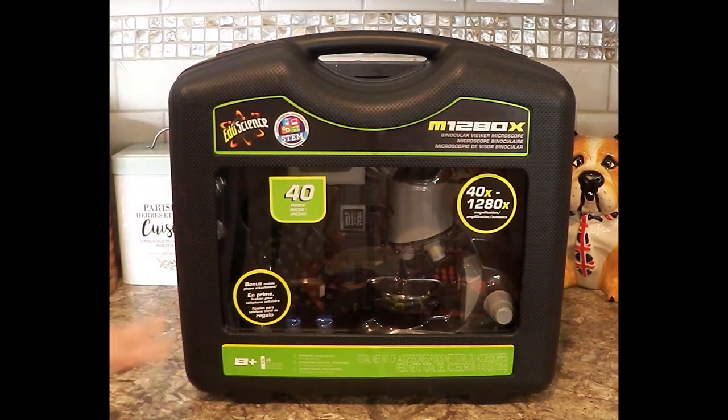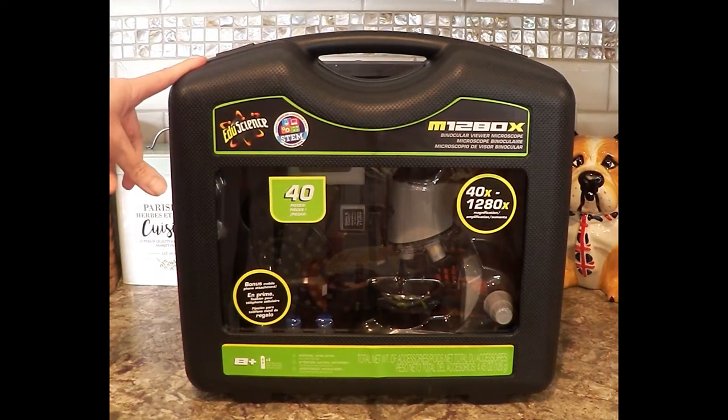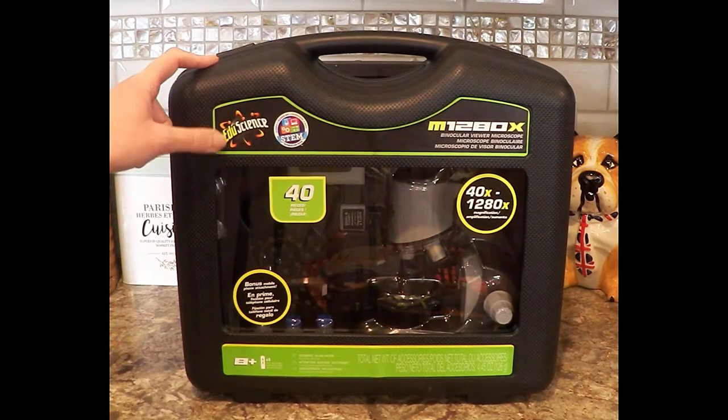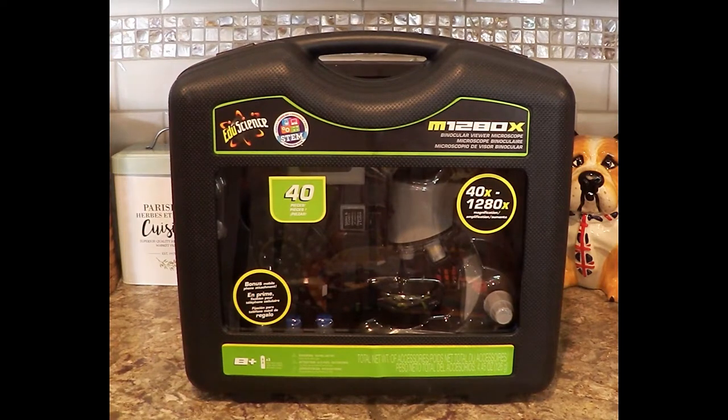So we've been looking at a microscope, and we have a bunch of slides that we got with something else for our little guy. I saw these EduScience kits. This was the top of the line that they had there. I believe the price at Toys R Us is $90, and it was down to like $52 or something. So I checked online real quick, checked with my husband, felt it was a good enough deal. We have a bunch of slides.